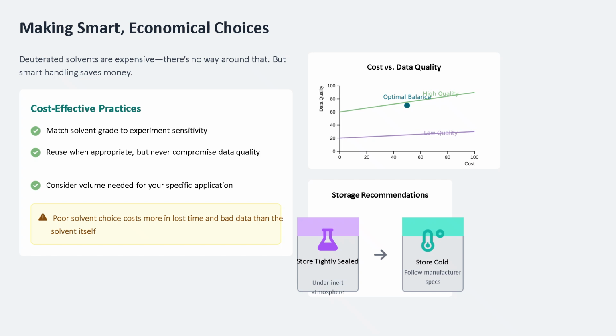To wrap things up, deuterated solvents and standards are far more than laboratory accessories. They stabilize the magnetic field, define chemical shift references, and clarify spectral signals. When chosen wisely, they transform noisy data into clear, meaningful insight. The right deuterated solvent and standard can turn a good NMR experiment into a great one, shaping the story your spectrum ultimately tells.